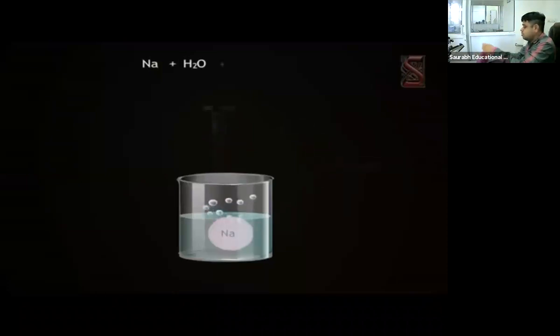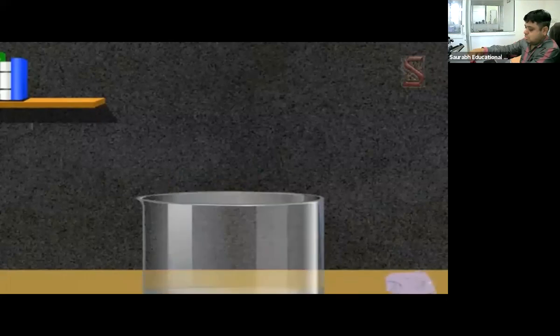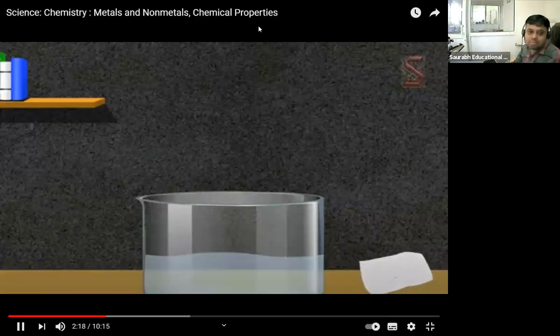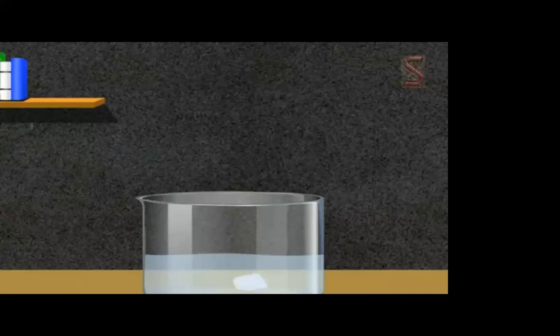Metals react with water, but all metals do not show the same kind of reactivity. For example, sodium reacts vigorously with water and oxygen and produces so much heat that it catches fire. That's why sodium is stored in kerosene to prevent it from coming into contact with moisture and oxygen. Let's try an experiment. Take a trough. Fill half of it with water. Now, carefully cut a small piece of sodium and dry it using a filter paper. Then, wrap it in a small piece of cotton. Place the piece of sodium in the water trough. You will observe that sodium reacts vigorously with water, catches fire, and moves about in the water, making a hissing sound.